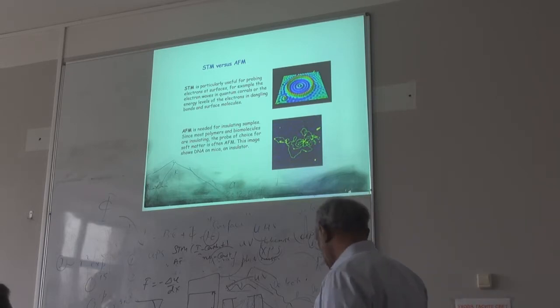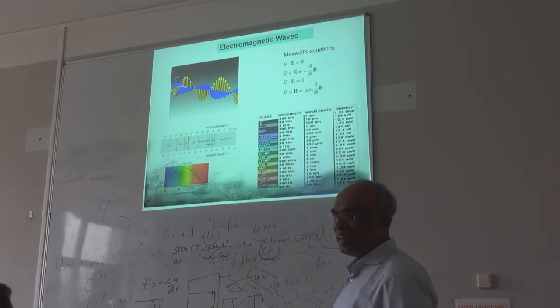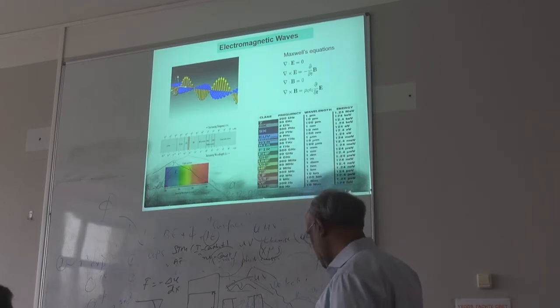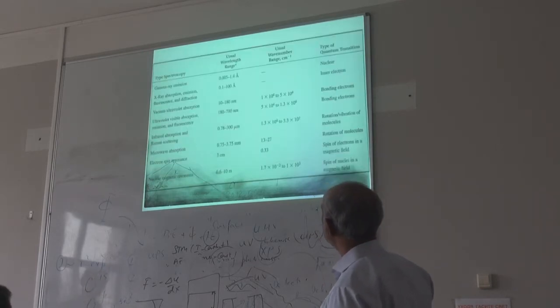Okay, so then I will quickly go through some optical techniques. So far we were talking about electrons, right? Now if you want to use the optical, is everybody familiar with electric and magnetic fields and their frequencies, Maxwell equations? Those are the fundamental things. So then the frequency, energy ranges, all these things. These are some of the techniques people use. So if you go from X-ray, all these things, you need to have angstrom nanometer scale.